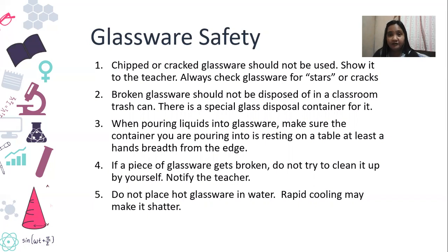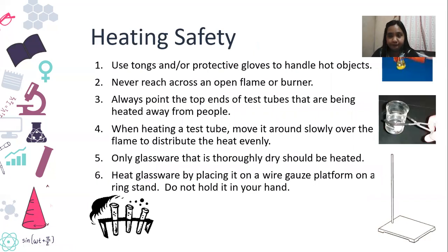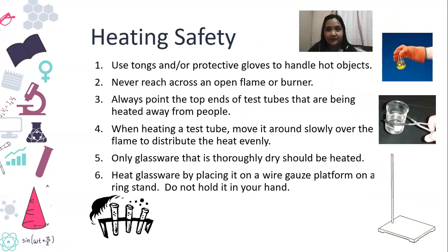Three hours is more than enough time for you to finish an activity in the laboratory. For heating, let's go. Use tongs for handling hot objects. If you have a holder, which we call the pot holder in the kitchen, please use it. If you have gloves, use them. Never reach across an open flame or burner. So, for example, if we're heating something, never go across. Please keep at least a foot distance from that burning flame.